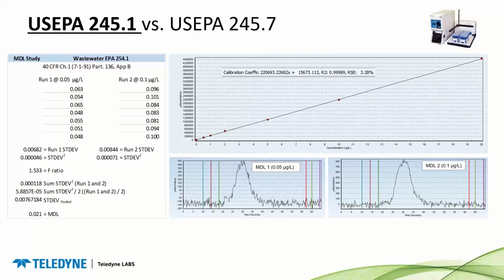And the calibration curve looked really great. I also used peak area mode instead of the typical peak height mode. And this allowed me to gain some speed on my run, just eliminate some sample time.